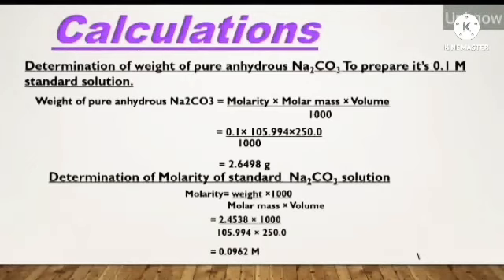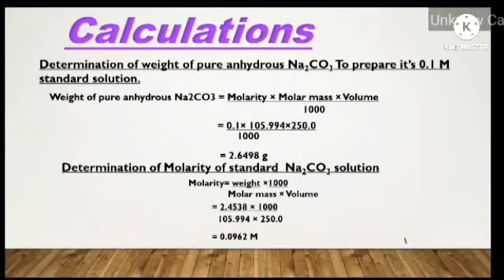Now come to the calculations. Determination of weight of pure anhydrous sodium carbonate to prepare a 0.1 molar standard solution, using the formula weight equals molarity multiplied by molar mass multiplied by volume divided by 1000.